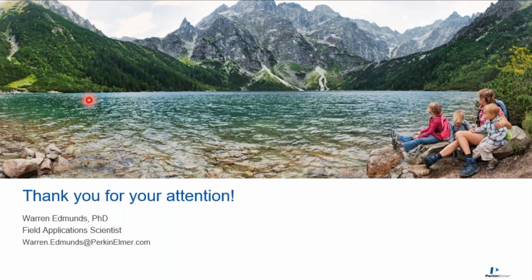Gotcha. Thanks, Warren. This one I'll ask in tandem because they're actually sort of similar. Can you comment on cleaning the transfer line and how often it needs to be cleaned? And I guess in tandem with that, the TGA design, is there any chance of residue buildup on the TGA, and how do you clean it?